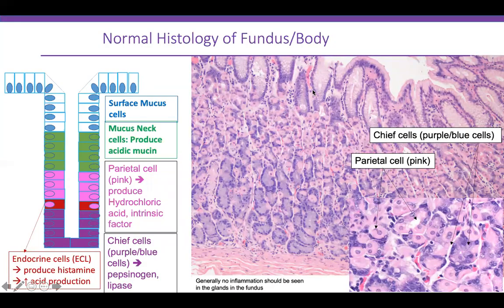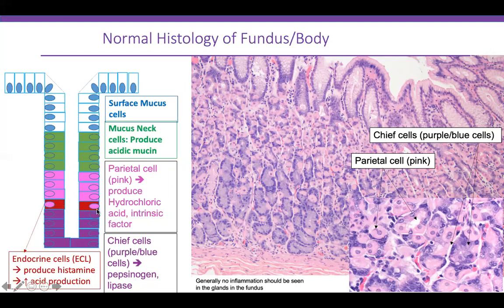This is the normal histology of fundus or body epithelium showing oxyntic mucosa. The surface is lined by surface mucus cells, then you have mucus neck cells which produce acidic mucin, and then the pink parietal cells visible here. These pink cells produce hydrochloric acid and also intrinsic factor. Intrinsic factor binds vitamin B12 in the stomach, protecting it from degradation until it reaches the small bowel for absorption.